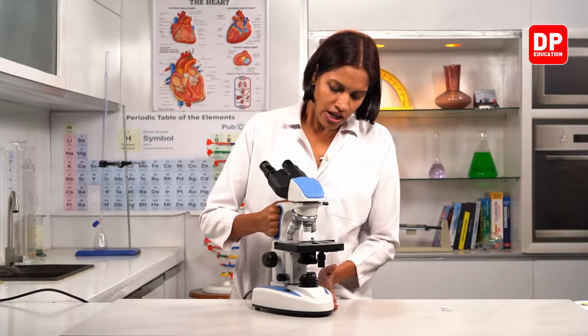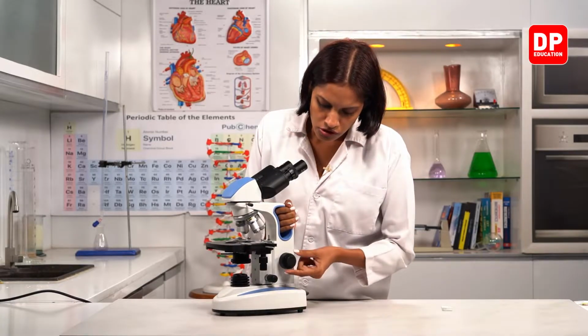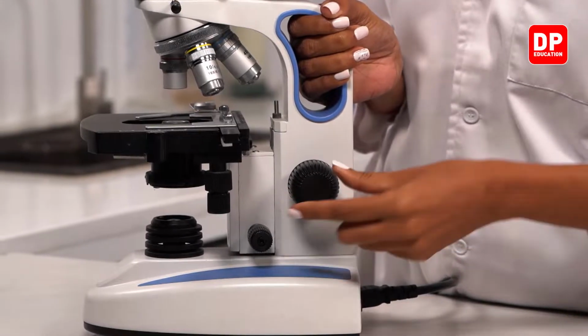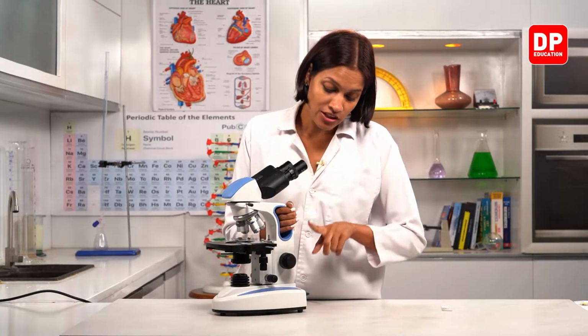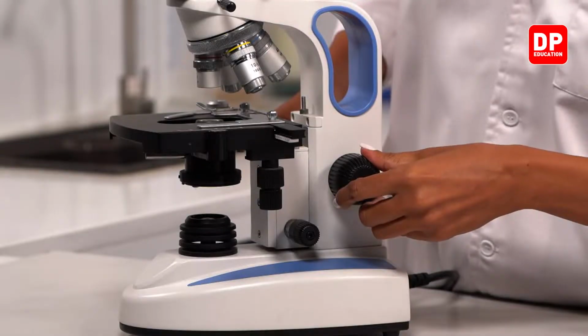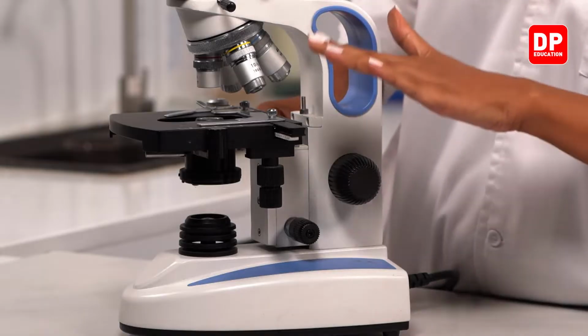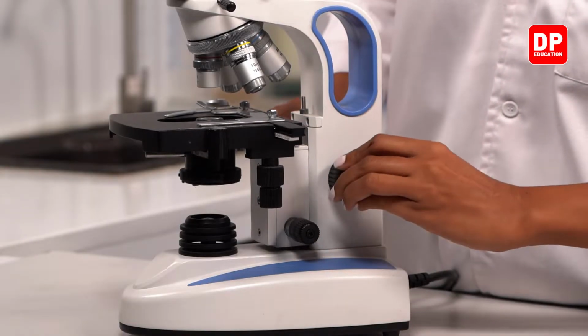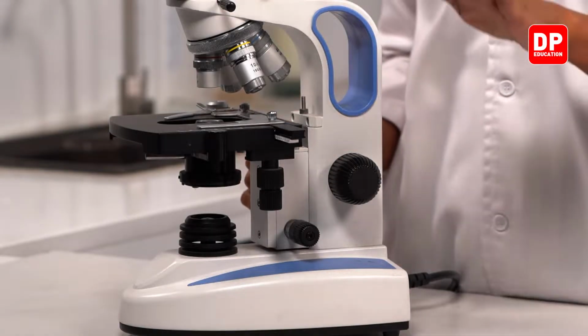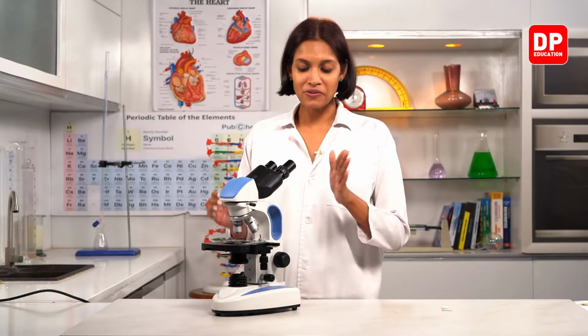Right. Now look at these 2 knobs, children. You all can see, you all can rotate it. Now this bigger knob is known as the coarse adjustment knob. Now what happens when I rotate this one? You all can see in this microscope, the stage moves up and down. But in the basic microscope in the lab, what happens, children?